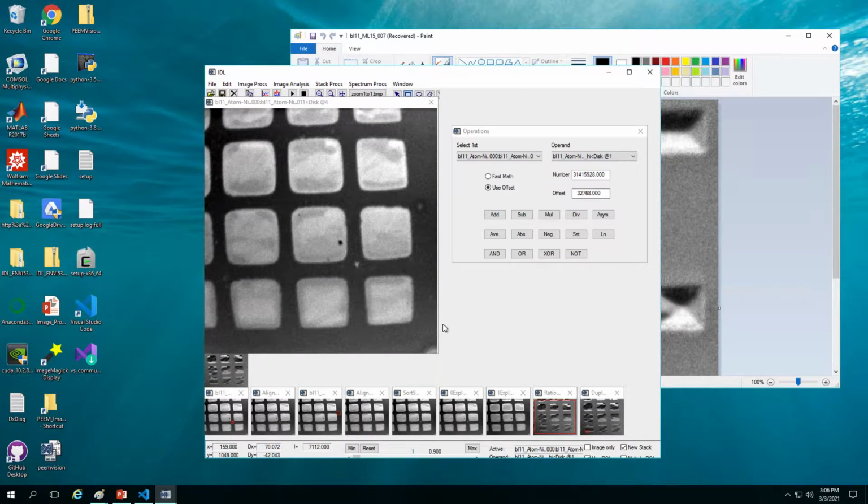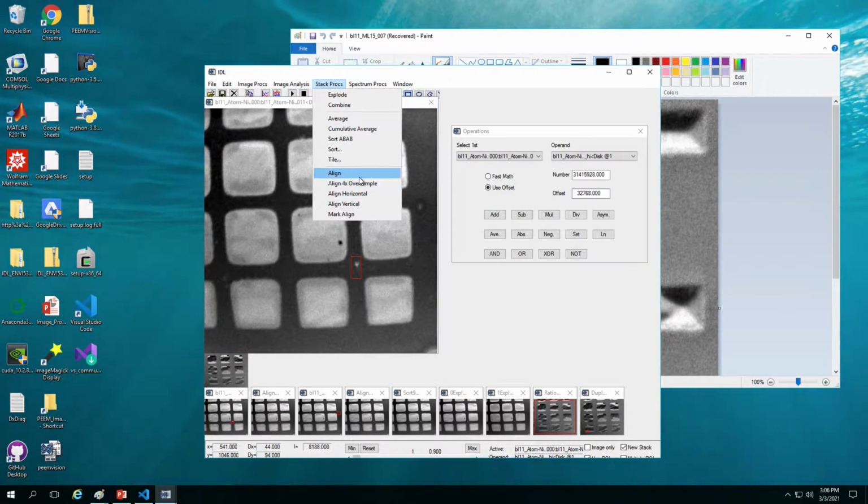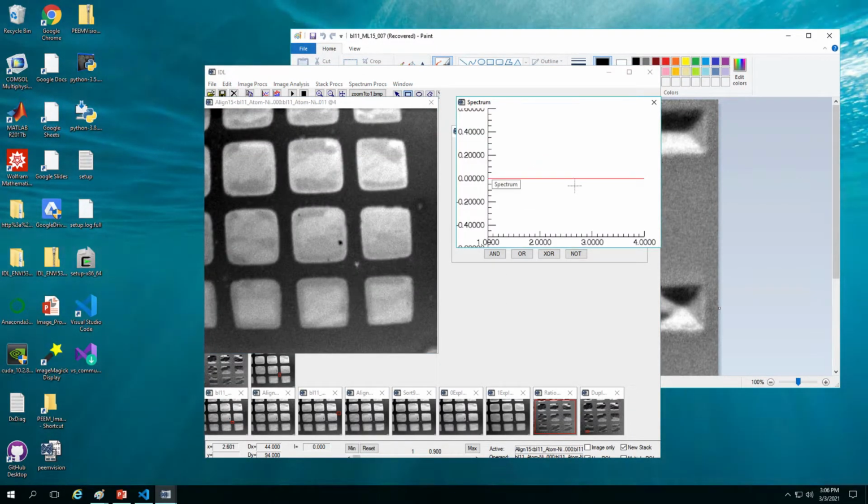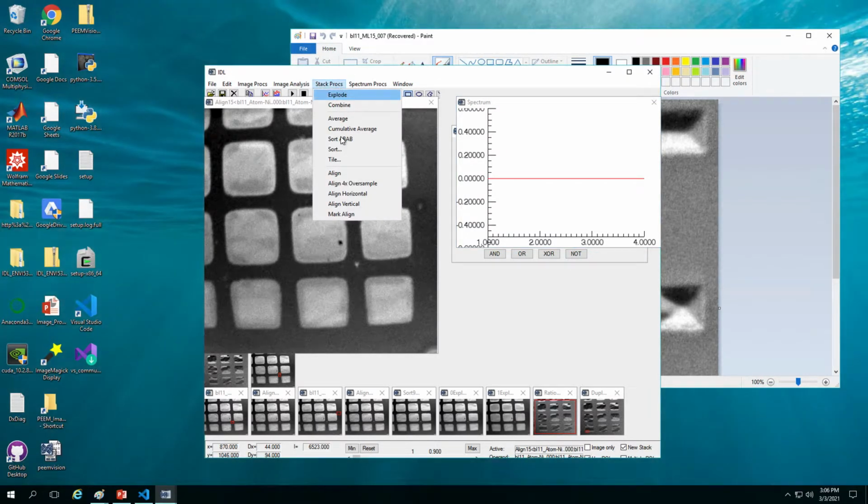So similar process, we redo it. We first pick a region. Oops, my bad. We pick this dust here. It's not an artifact, it's just physically a dust there, but very likely not magnetic. We do a line. See, 1, 2, 3, 4, it's done. It's not too bad. A straight line is good, it means the alignment goes fairly well.